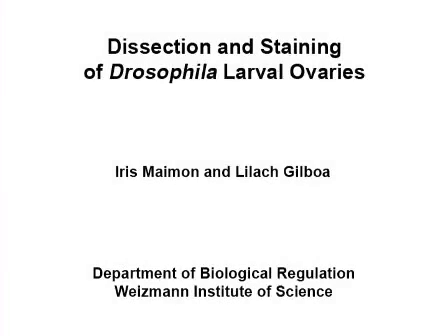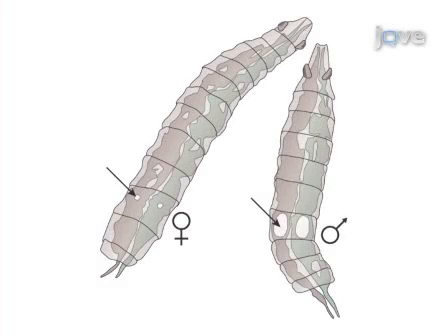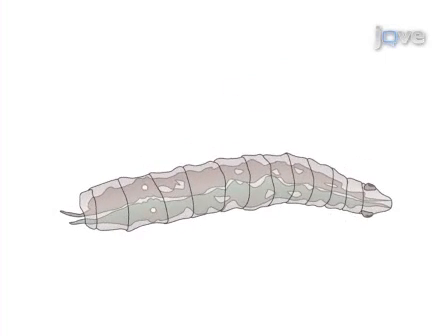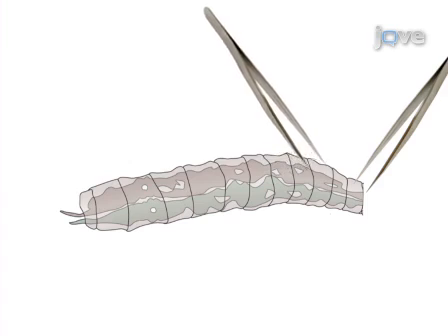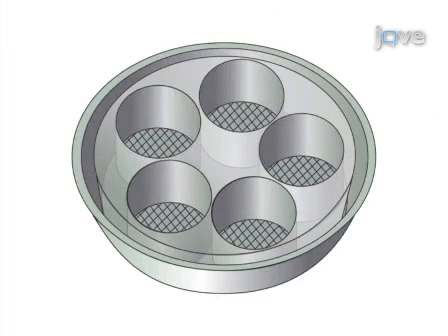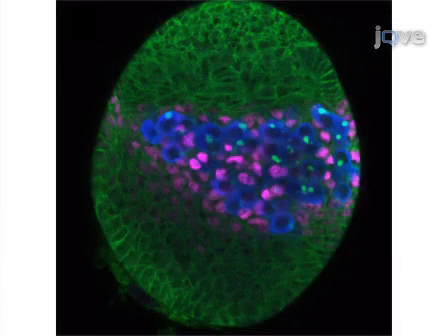The overall goal of this procedure is to visualize isolated ovaries from late third instar Drosophila larvae by confocal microscope. This is accomplished by first selecting female larvae from a synchronized population. The second step is to dissect out an intact fat body, separate it from the intestine and cuticle, and place it on ice. The third step is to fix, stain, and wash the fat body with embedded ovaries. The final step is separating ovaries from fat body while mounting. Ultimately, results can be obtained that show cell-specific staining through immunofluorescence microscopy.